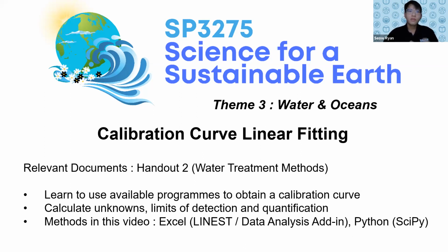So from there, with these various programs, you will be able to calculate certain unknowns, such as to find out the concentration of an unknown sample, and also to calculate the limits of detection and limits of quantification, LD and LQ. So I will not go into the details of what LD and LQ are, because that is what we will be covering in the lessons.